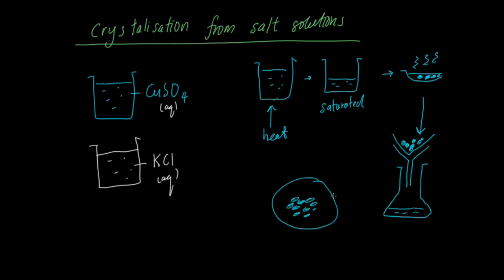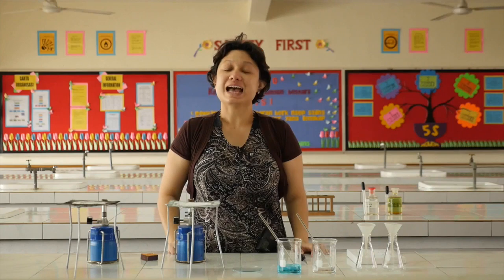Now, the same applies for any aqueous solution that you want to change into crystal salts. But these are for soluble salts. For insoluble salts, you don't have to do crystallization because they're already in the form of solids. Enjoy the experiment.